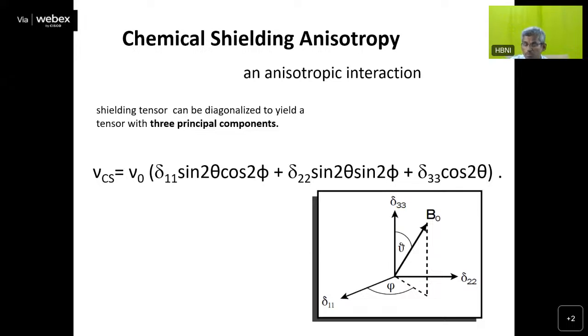I don't know whether you remember, but in the previous classes I was showing a line shape like this. Sometimes I was showing a line shape like this. In the last class I was showing, for carbon atoms, probably the sp2 carbon atoms in the phenyl rings, a line shape like this. For tin oxide, I showed a spectrum something like this. If you take a static spectrum, it will be something like this. And sometimes you get peaks like this one.